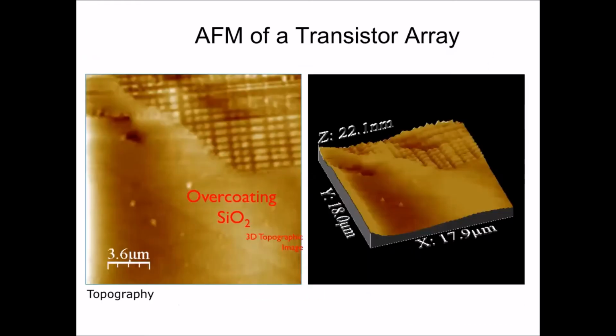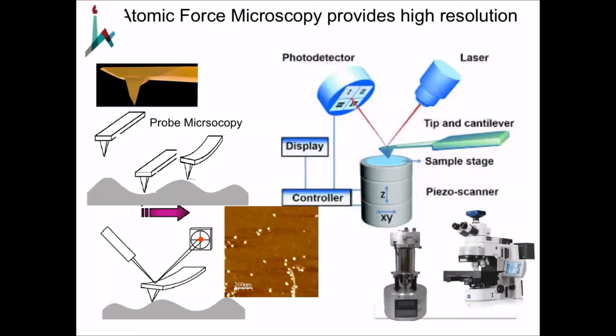Now, this is an AFM of a transistor that we obtained. What we see here is an AFM, okay? And this AFM has little in it that says, you know, I really want to integrate with an optical microscope, okay? It's blocked from the top, blocked from the bottom. And many of them are like that, okay?